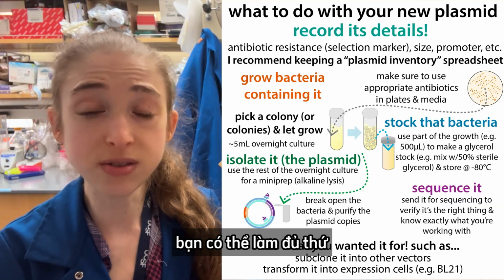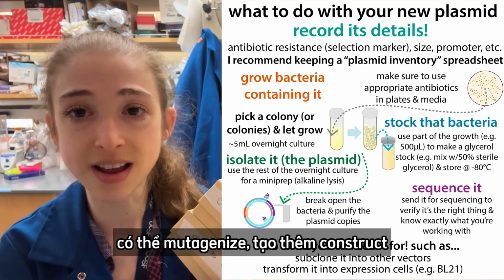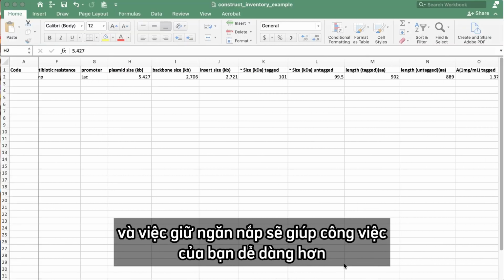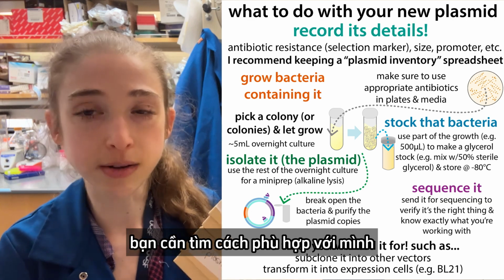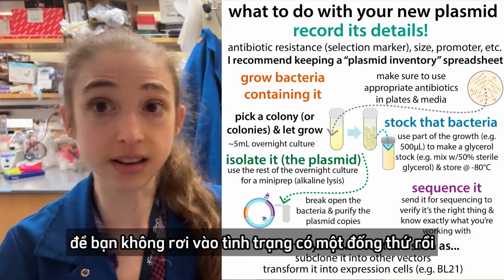And you can go and do all sorts of stuff. You can express proteins, you can mutagenize those, make more constructs, have more clones in progress, and then more verified clones, all that good stuff. And keeping organized is going to make your life a lot easier. So hope this helps. This is just how I strategized. You need to find what works for you, but start early so that you don't end up with a bunch of things and have no clue what's what.